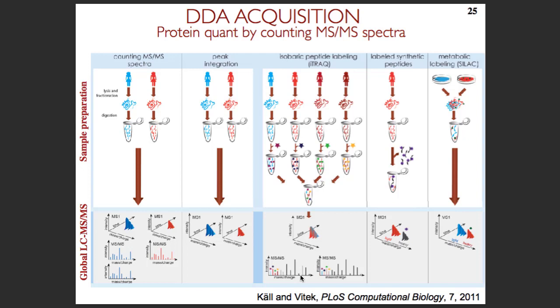Because now, the fact that the precursor is selected for fragmentation, this is something which is determined by the instrument while acquiring the data. So we cannot necessarily go back and computationally make sure that every run has the same precursor ion fragmented. This is something which happens experimentally inside mass spectrometry.